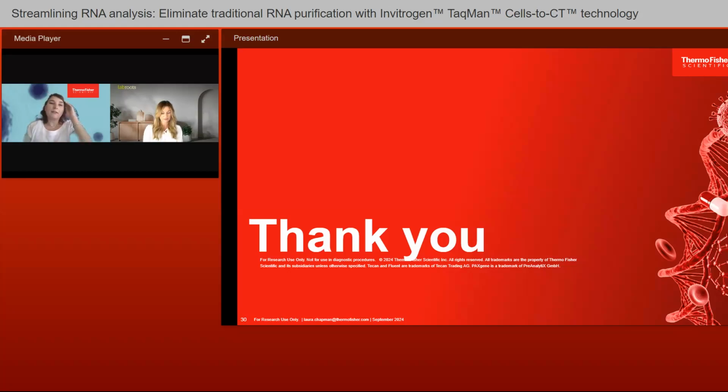And so depending on if you're using liquid handlers or if you're processing them by hand, that can gauge how many samples you would be able to process within those time constraints. In general, I would say the average turnaround time for a 96-well plate would take only the 5 minutes of lysis to do. And then you would be able to do your RT.